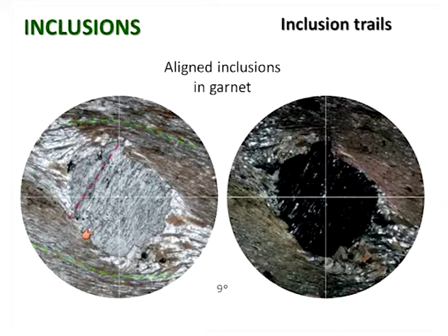As it grew, it just grew in situ, and after it stopped growing, the whole rock was deformed, and the fabric in the rock was turned through 90 degrees. So all the minerals outside the garnet recrystallized into a different orientation. So you've got an internal fabric, first deformation event, and then the garnet growing over that, and then a second deformation event.